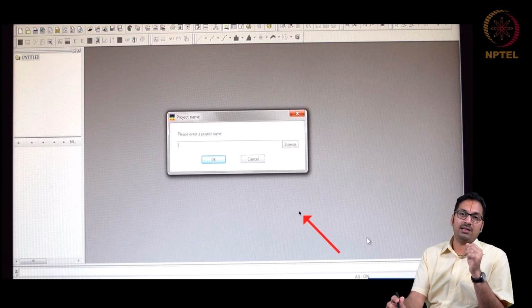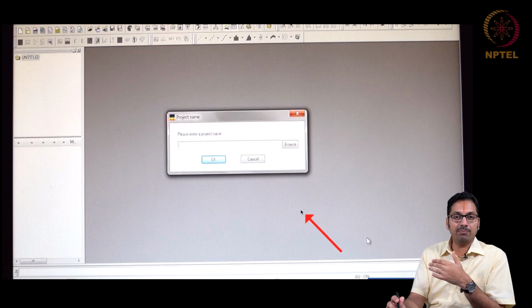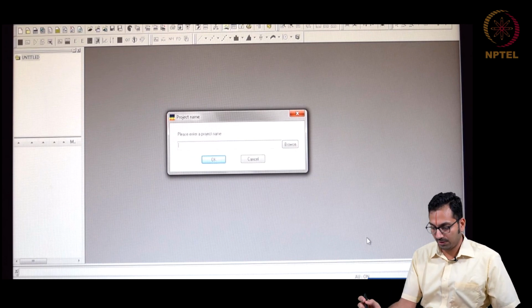So this experiment is nothing but having the ANS dye in water, measuring fluorescence and adding small portions of the sodium dodecyl sulfate, the stock solution that you have prepared, into this cuvette and seeing how the fluorescent intensity changes. So that is all the experiment is going to be about.